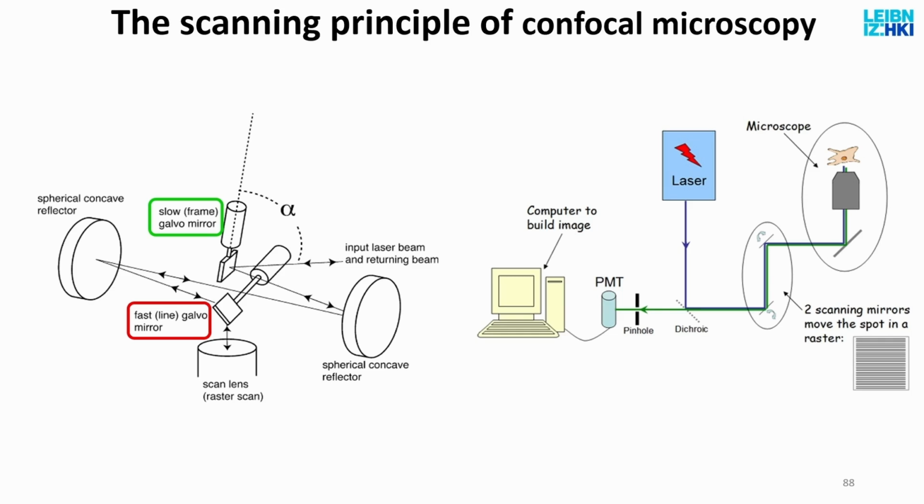Now, when you look at your confocal image, it says 1024 by 1024. What does that mean? That means that it moved the beam 1024 times along the y-axis. What does the other 1024 mean? How many little dots in the image will it detect? You will get from that, right? One. The beam is moving continuously. So what does this 1024 mean? The laser doesn't go like that. It just goes continuously. So what is a pixel then in a confocal microscope? The pixel is up to us.